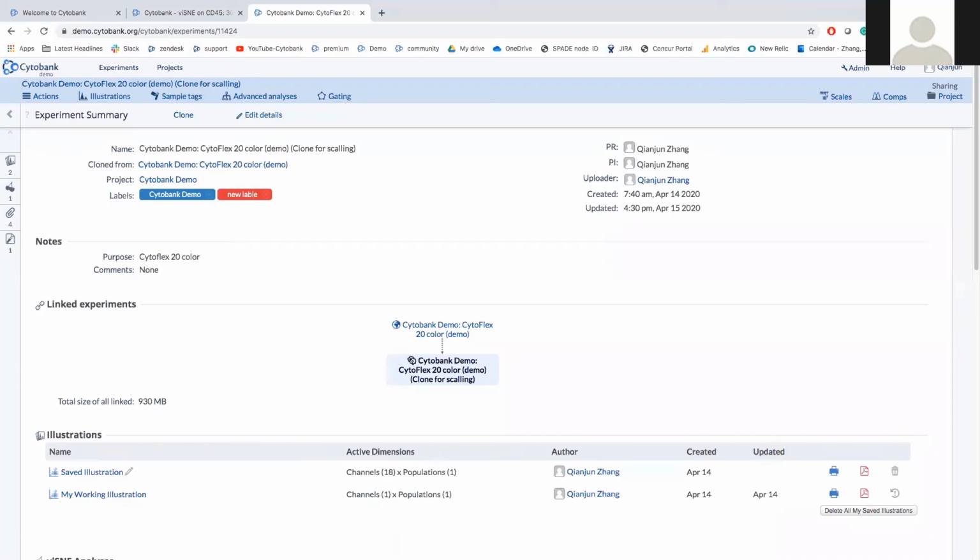Thank you, Steph. So we have another user question regarding the account. How many users can use the same Cytobank account at the same time? Thanks for asking. In general, we do not recommend account sharing. Per our license, it is one license per user. Each user can have access to their own account, so that's kind of our license agreement.